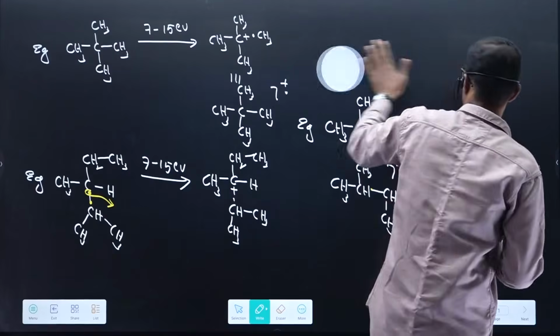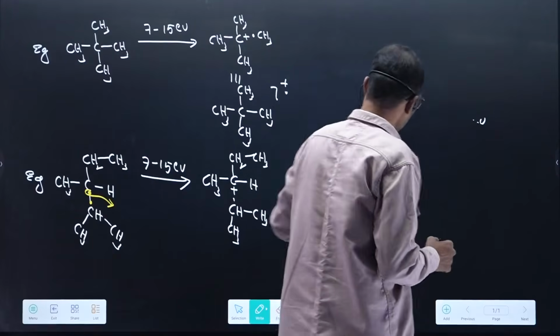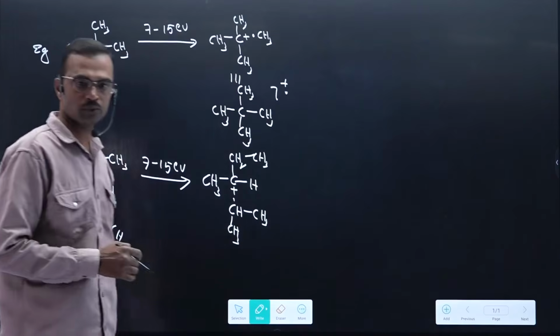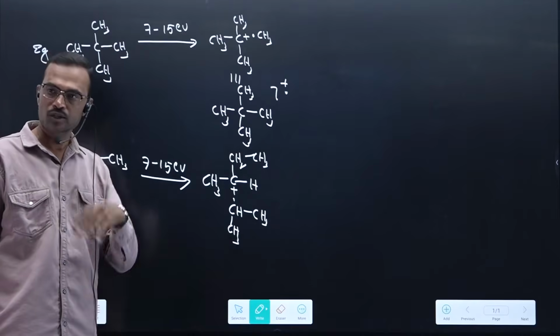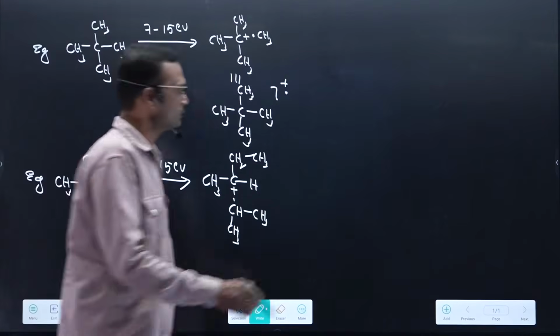These basics are very, very helpful for mass spectrometry. Remember, if you are unable to understand the basics in mass spectrometry, it is impossible to enter into the concepts. They are very, very important basics. You need to know from where we need to break. After generation of the molecular ion, if you don't know where to break, it is no use.